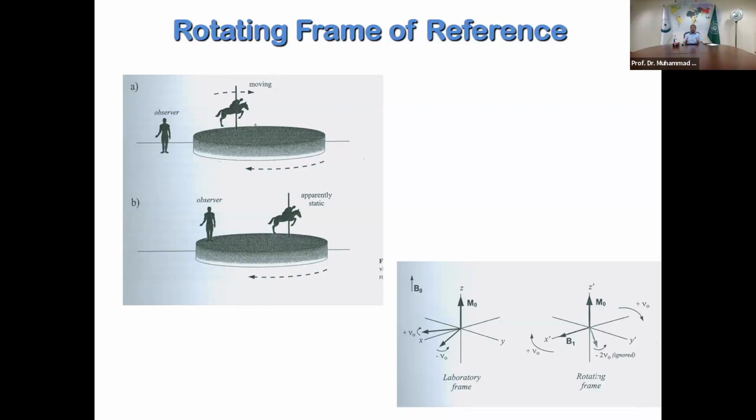And with time, which is called time delay, very important in modern NMR spectroscopy, because the delay which you give before you give a next second pulse or open a detector defines where these vectors would be on the XY plane. Okay, so this is a crucially important concept in NMR spectroscopy in order for you to understand what will happen after some time on the rotating frame of reference.